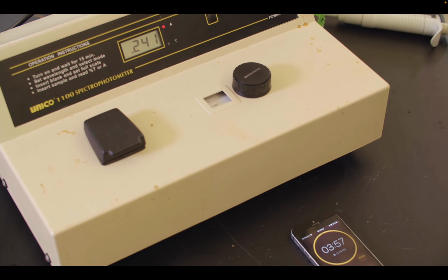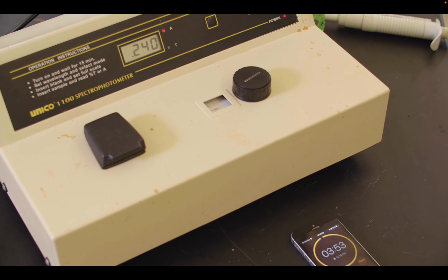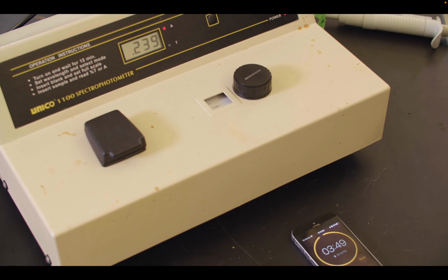All right, so the beginning absorbance is 0.242 at time 0. You'll notice that it started going down fairly quickly, right away. It's degrading. Again, we want it to be fairly linear, as best as possible, over about a 4-minute time period. So we're going to observe this for 4 minutes, taking data points every 30 seconds. Really, we're most interested in the overall change after 4 minutes.